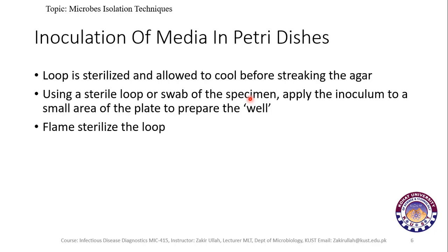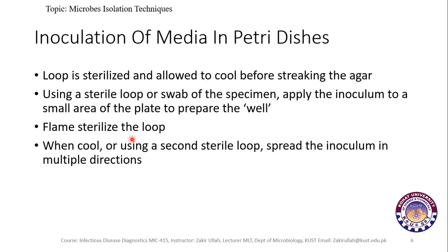Then again sterilize the loop with the flame, and when it cools, or using a second sterile loop, spread the inoculum in multiple directions.